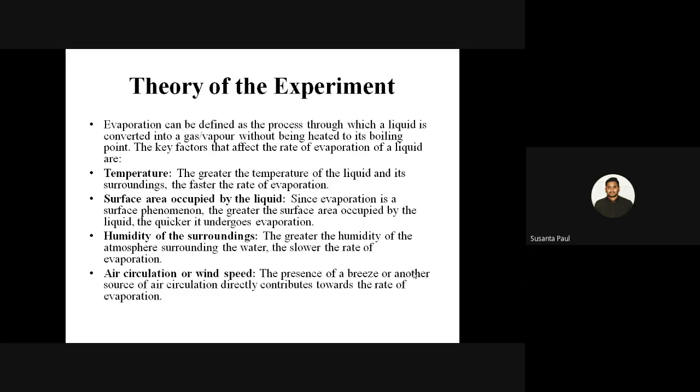Evaporation is generally a unit process by which we can remove water, and the water goes directly into its vaporization state due to a sudden increase in temperature. The main objective of evaporation is to get a concentrated product by vaporizing the volatile liquid. Evaporators are the equipment used to carry out the evaporation process, and evaporation is conducted with a non-volatile solute and a volatile solvent.